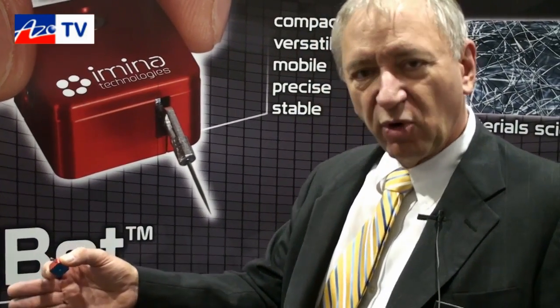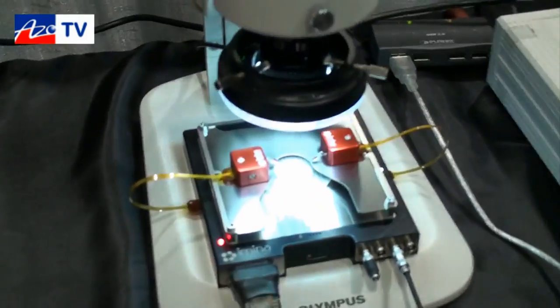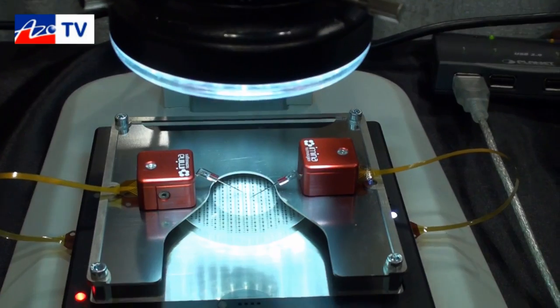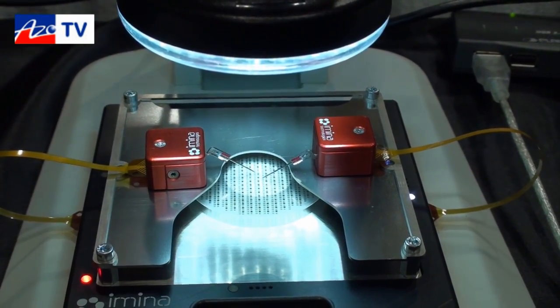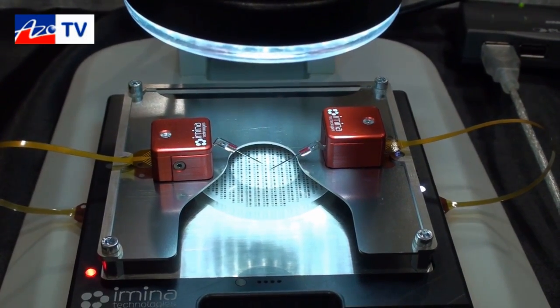So a lot of flexibility, very small size, and novel technology. If you want to step across here and see how they look in a more real environment, you'll be able to see a microscope — an optical microscope set up with two probes, two MyBot manipulators placed over an LED wafer that can be probed and powered.